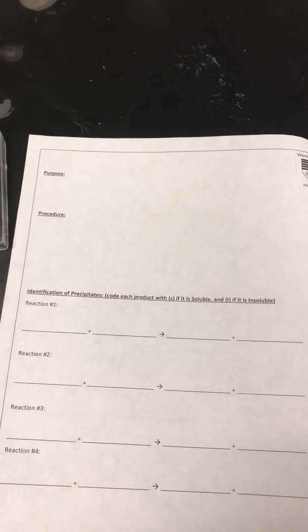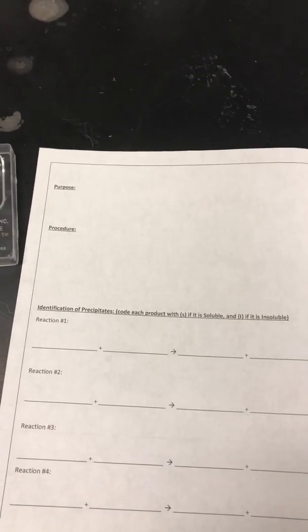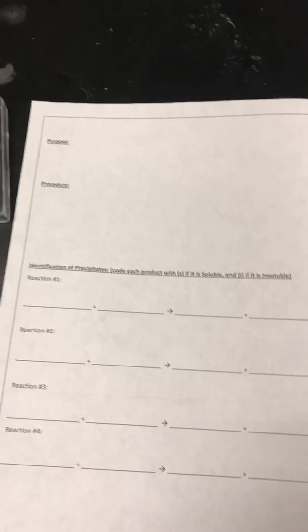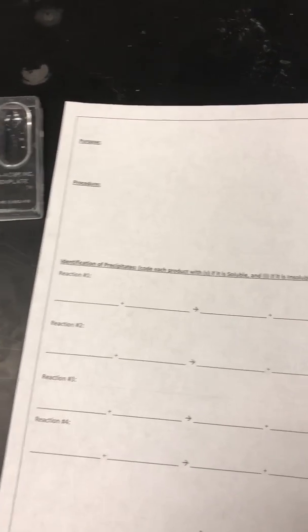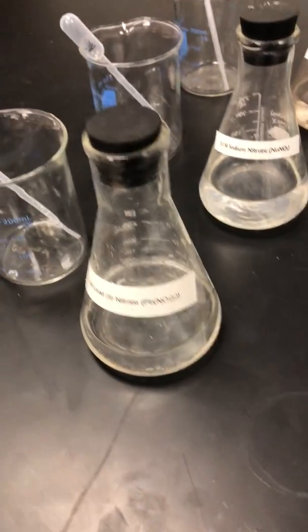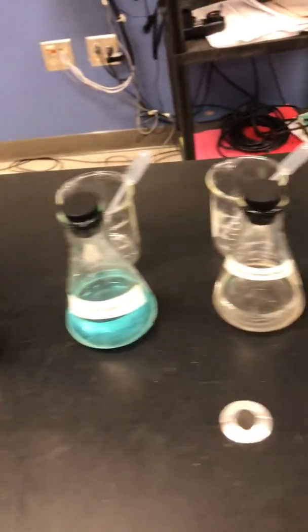Purpose: we are going to be able to do double replacement reactions and predict precipitates. Got it? And the procedure. The procedure for this lab is you're going to take each of these chemicals. I'll show you them more in depth in a second.